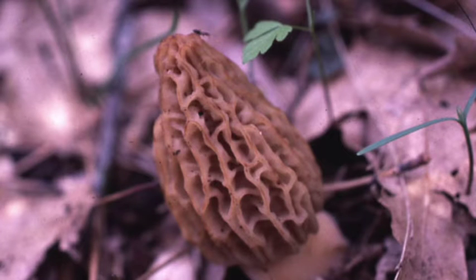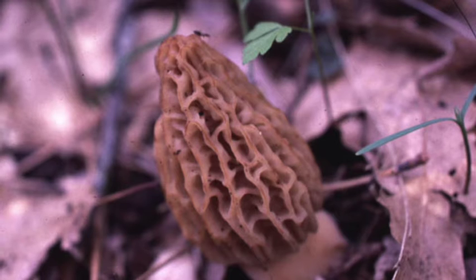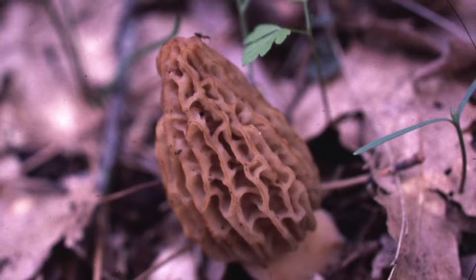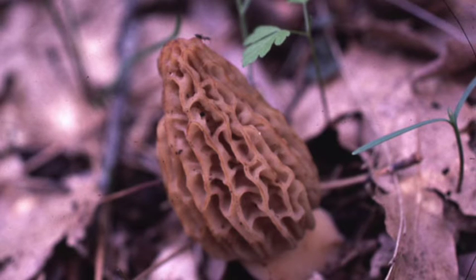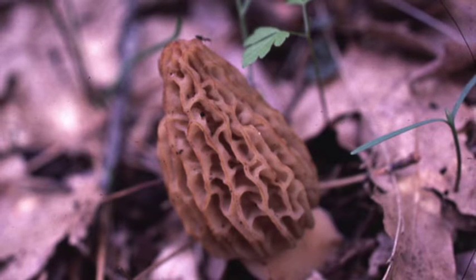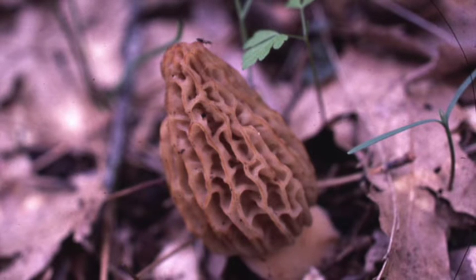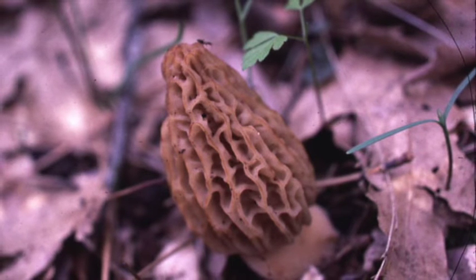In class we have two representatives of the division Ascomycota. Here is one of the two representatives. This is the genus Morcella, which is commonly called a morel. Morels are delicacies — they're really good to eat — and they often come out after burns and are actually found quite a bit locally here.